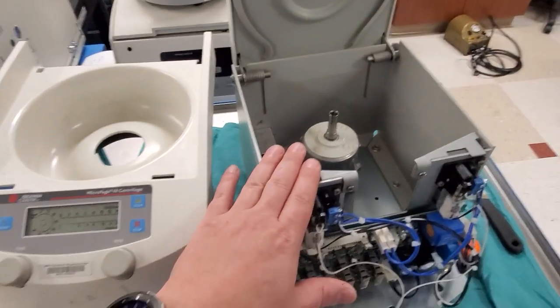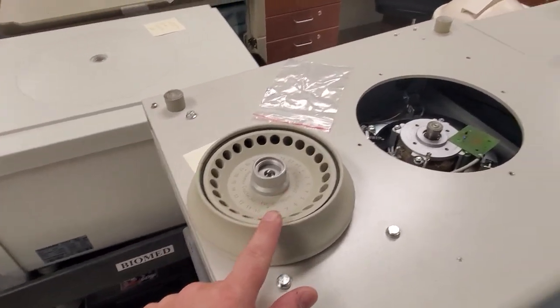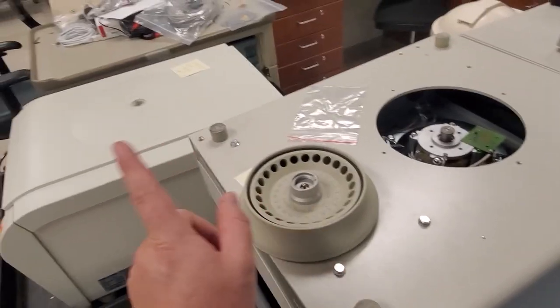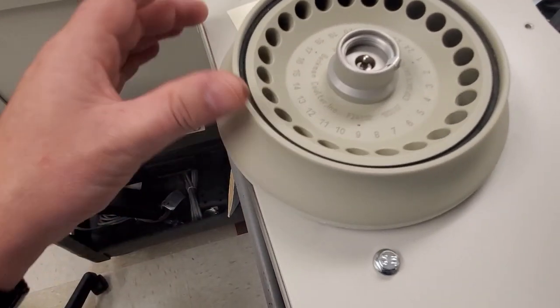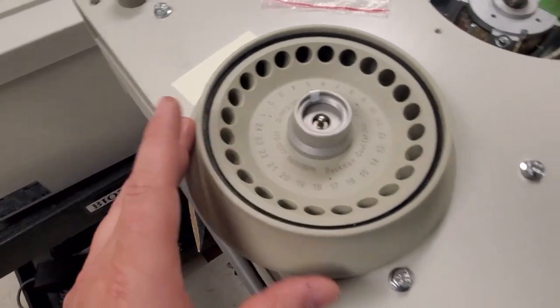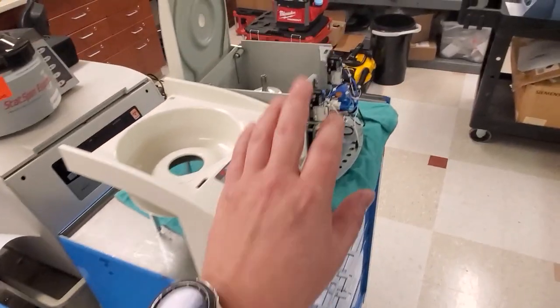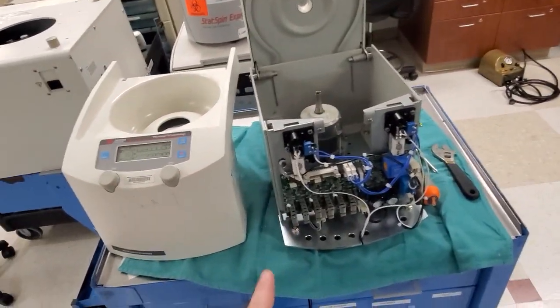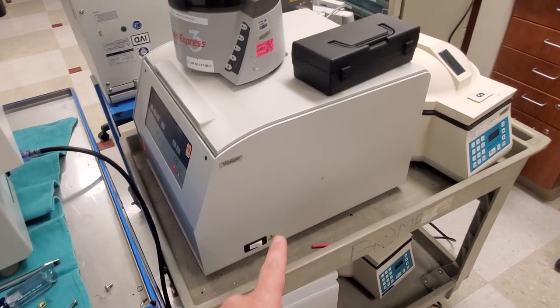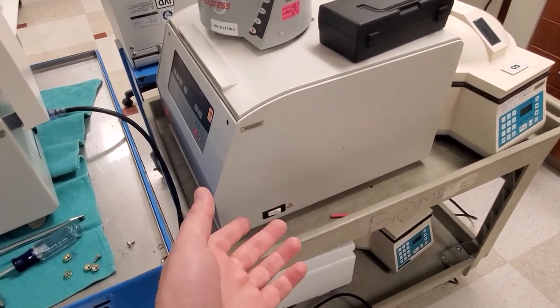That's basically a centrifuge in a nutshell. One of the things I should point out is that the rotor determines the maximum RPM of the centrifuge. There's always a speed written on top of the rotor — you can see right here it says 14,000 RPM, so this rotor is rated 14,000 RPM, which means the fastest this guy can go is 14,000 RPM. These guys here have a rotor rated at 3,500 or 4,500 RPM, so the fastest you're supposed to ever take that guy up to is 4,500 RPM.